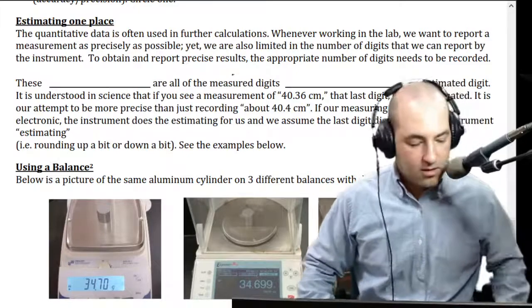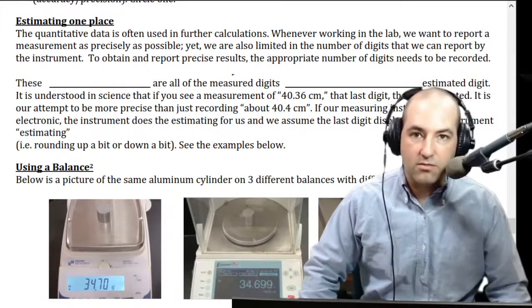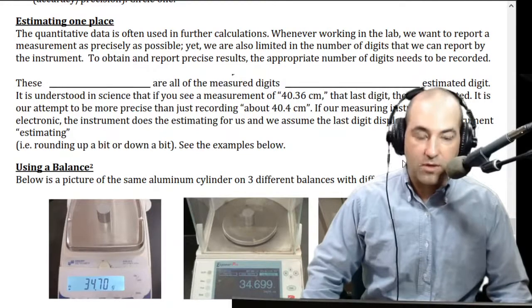All right. Today we're going to look at the rest of this packet, which probably involves new stuff for most of you, how to take a proper measurement in the lab. Now, those of you who were in lab yesterday, you may have noticed this.